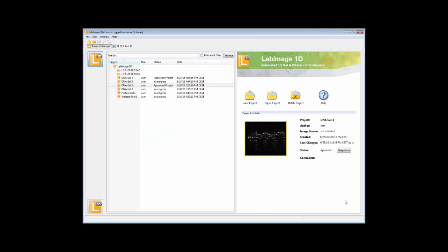Even the macro mode will work with LabImage 1D. You can define your own batch process and apply it either to a single image or image stack. Each action will show up in the audit trail.